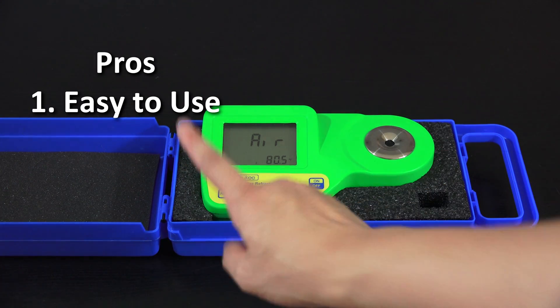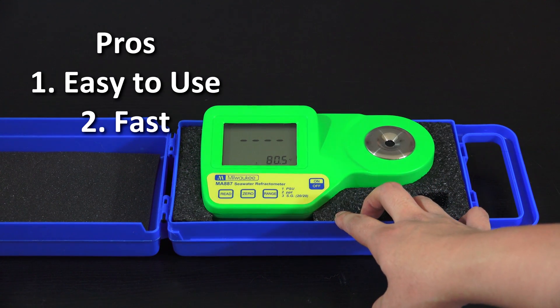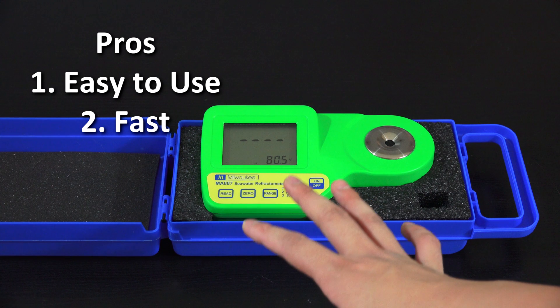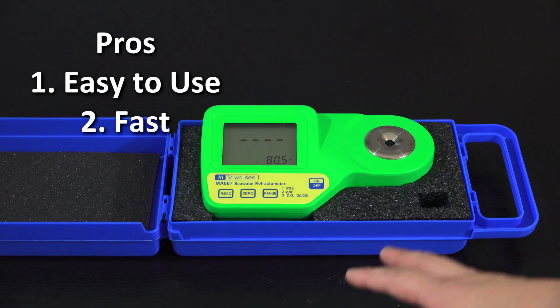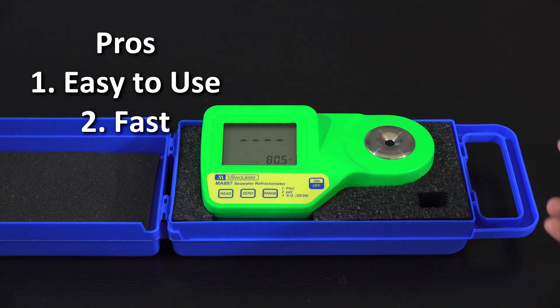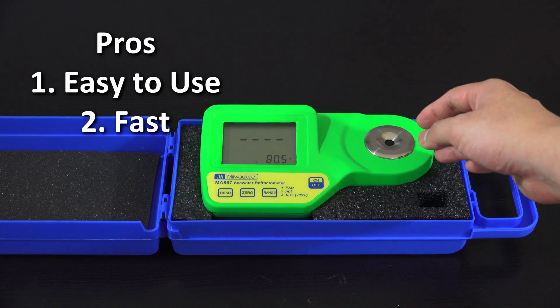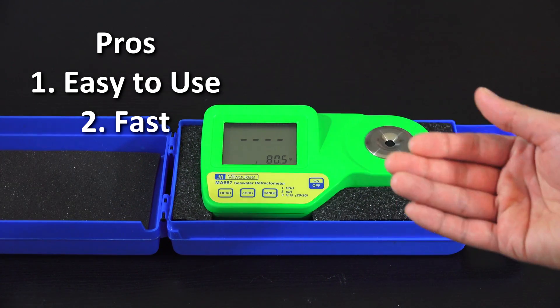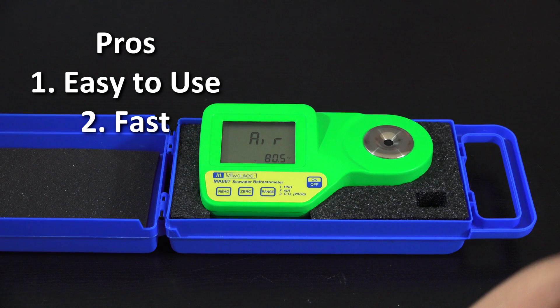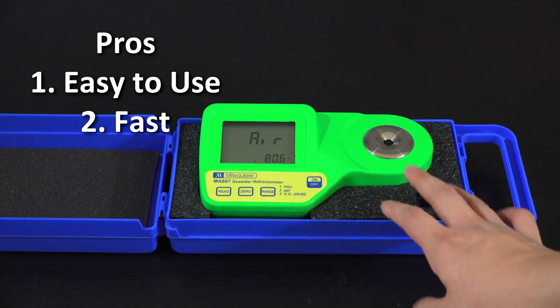Pro number two is it's fast. If I'm measuring the salinity of my water or a mix, instead of going back and forth placing water in and looking through an eyepiece making sure bubbles aren't throwing off the reading, I can just put the drop in, press one button, and it reads. If I don't think the solution was good enough, I just wipe it off, drop in another sample, press the button, and it reads again — no second-guessing or multiple attempts needed.